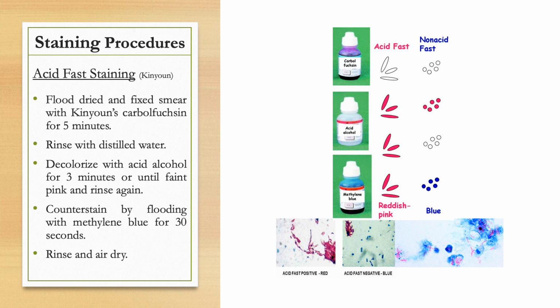So the appearance of acid-fast bacteria using the Kinyoun method is still the same as that of the Ziehl-Nielsen technique, in which acid-fast bacteria are stained red, while non-acid-fast bacteria are stained blue, as well as the background.